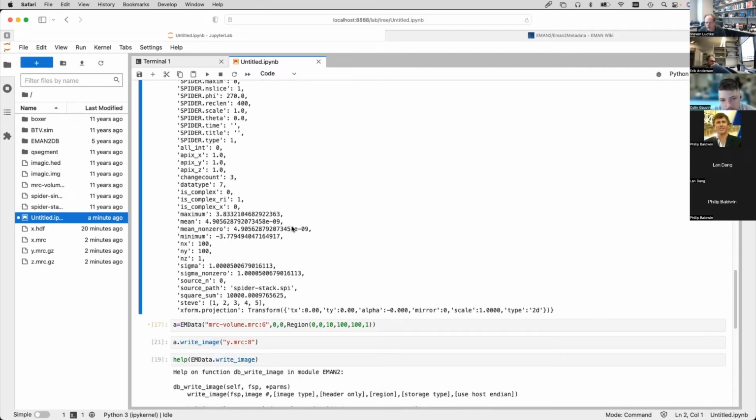And if all else fails, you can always use a string and pickle something into the string, if you can't come up with another strategy for saving it.